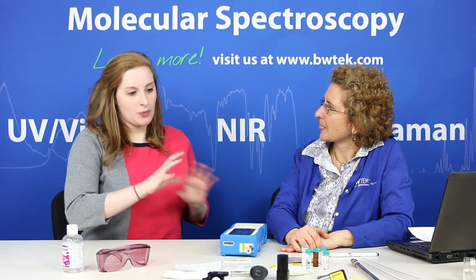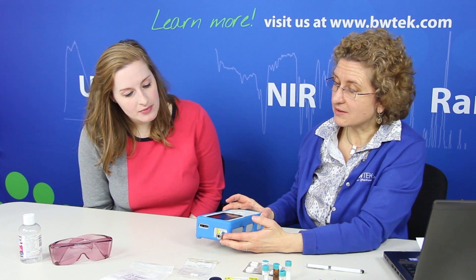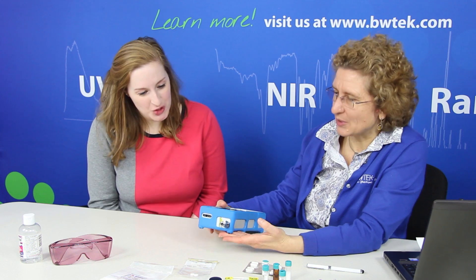I see a lot of accessories laid out here. So what are some of these accessories and why so many? Raman is a non-destructive technique and one of the advantages is that we can make measurements through transparent packaging. This point-and-shoot adapter allows us to make measurements directly by pointing and shooting at a sample.